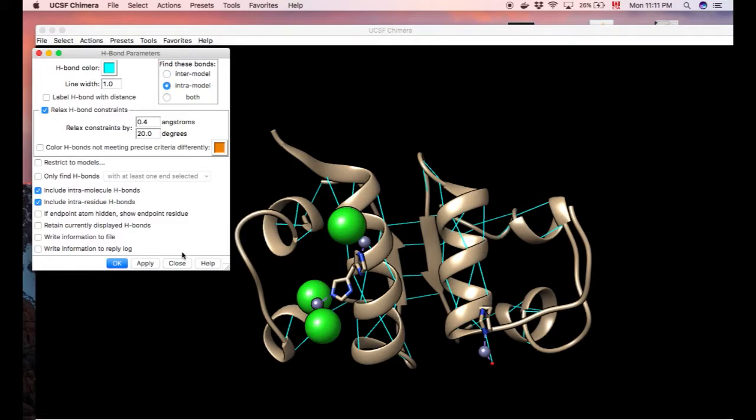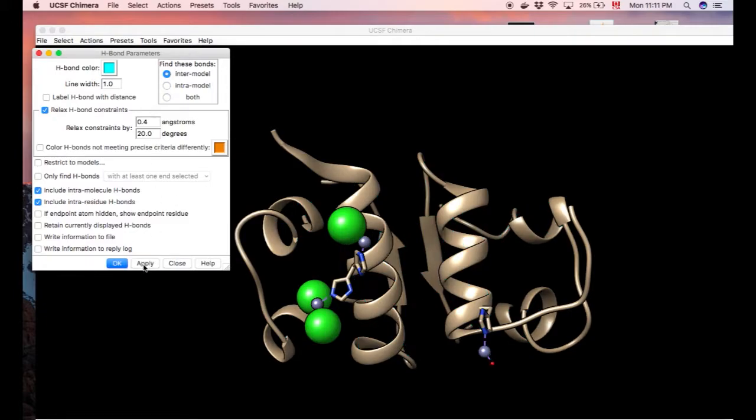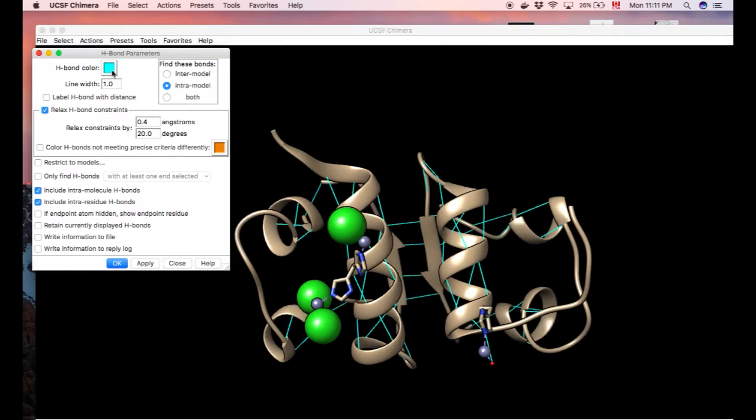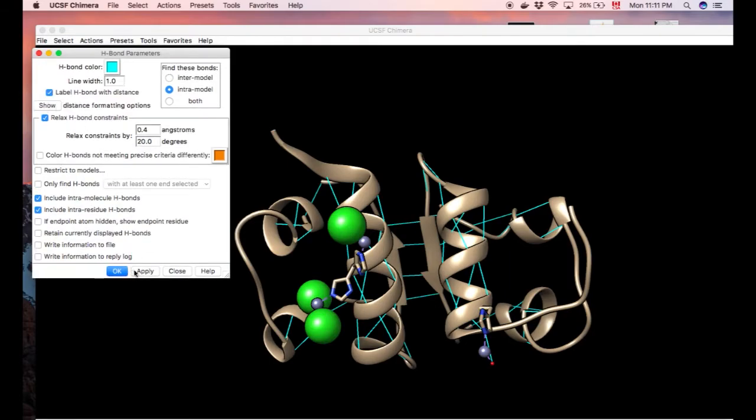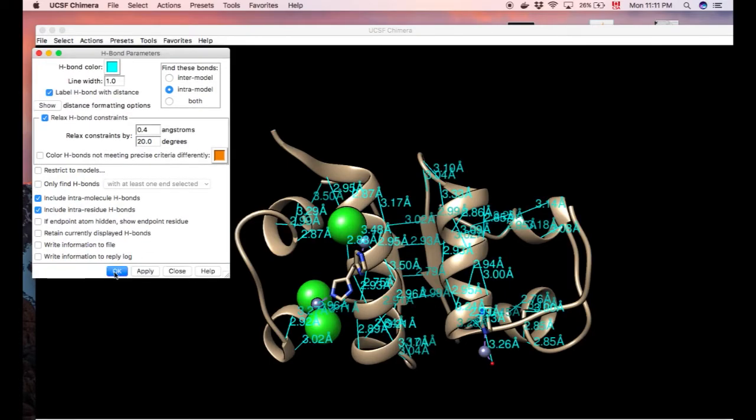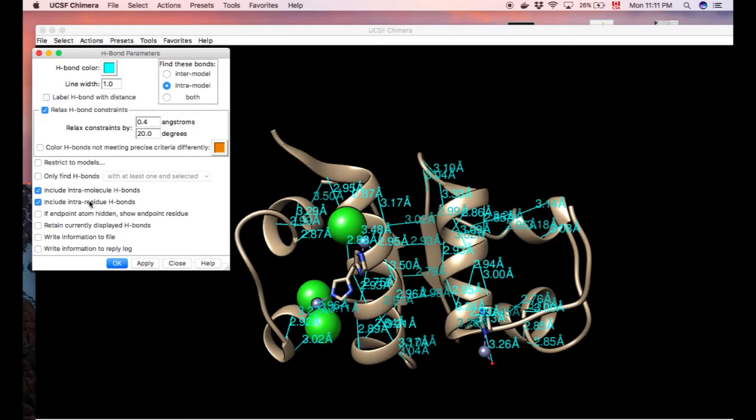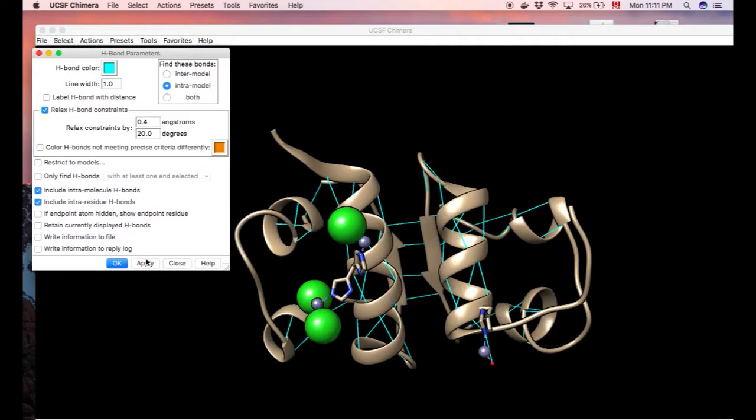You can change the selection between making them intra or intermodel. Here it's being selected as one single model, so of course you can only see them if you go interim model. You can add the distance. So now we're selecting everything. So of course we can see there's a slight variation, but it's all around three angstroms. To remove it, just rerun the script once again.